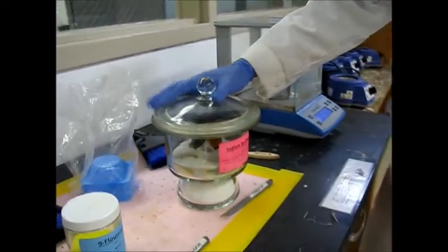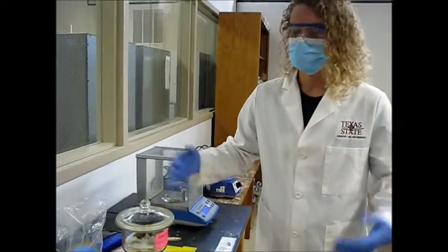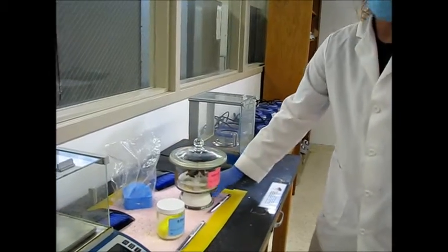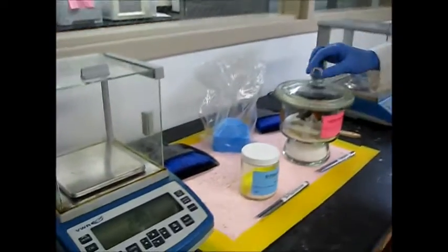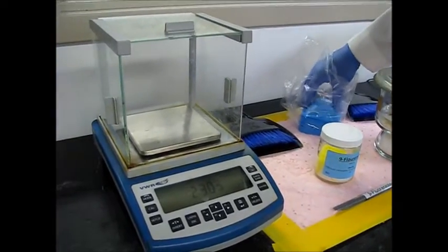Also do notice that we have sodium borohydride in this desiccator. That's because sodium borohydride is very hygroscopic and it will react with water in the atmosphere. So you can't just keep it in a jar like this. It needs to be sealed in its desiccator that will absorb all the water. So we're going to go ahead and measure out 200 milligrams of 9-fluorenone.